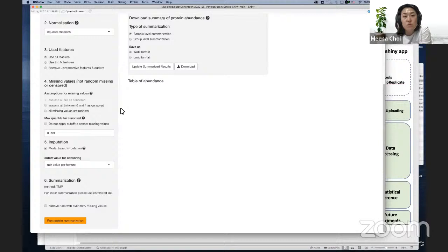Some tools provide NA for missing, some tools provide zero for the missing value, etc. So you have to decide which one to use. For Skyline, we treat zero as the missing value. So Skyline provides several more pieces of information than others.